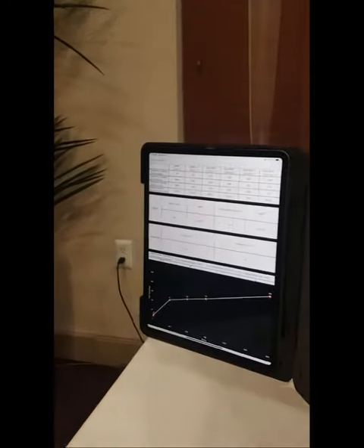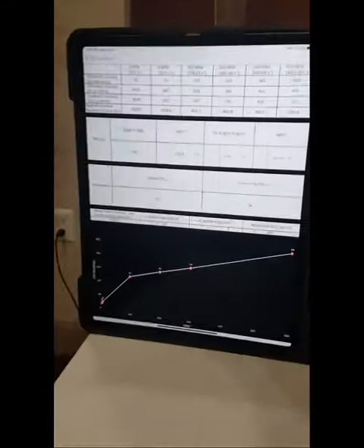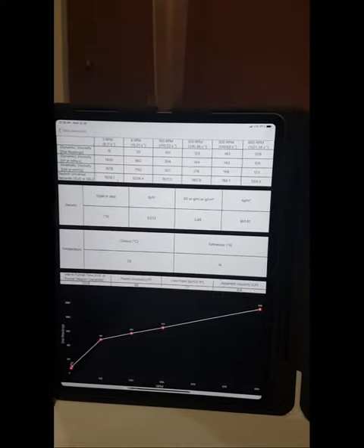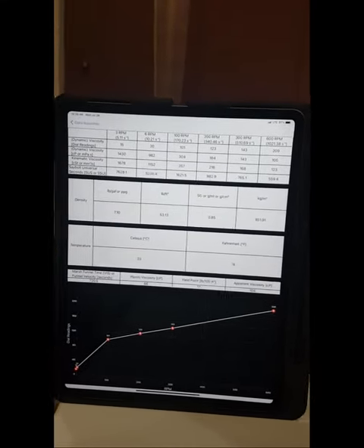This ensures accurate measurements without specially trained engineers and enables personnel to focus on other duties.